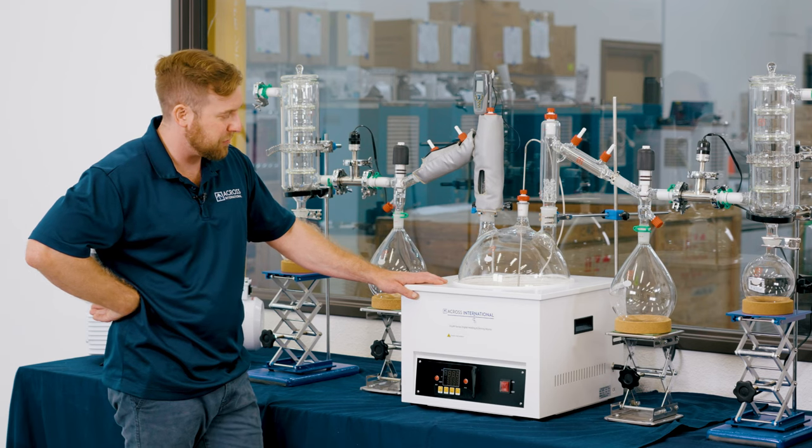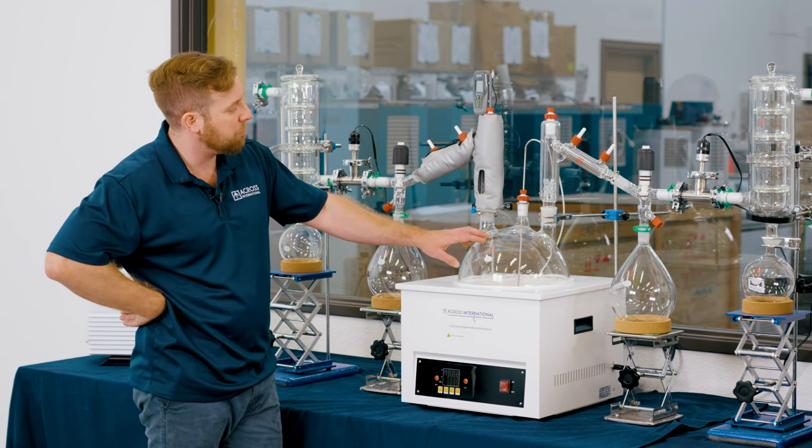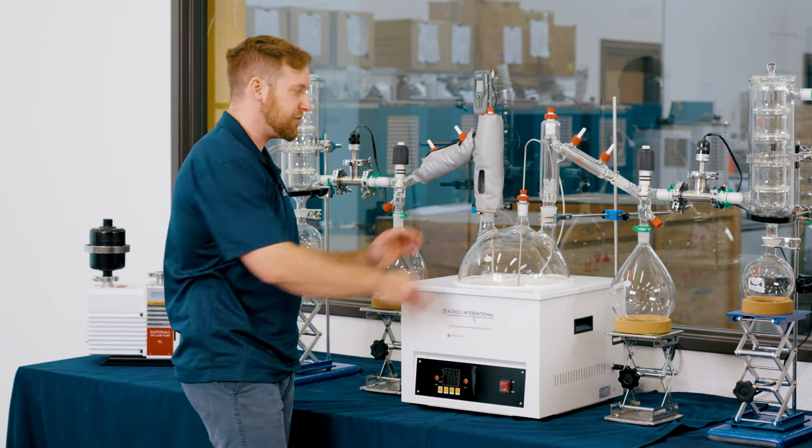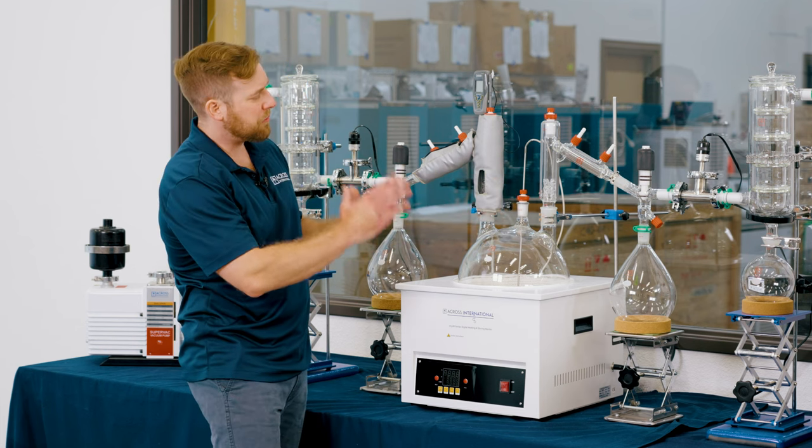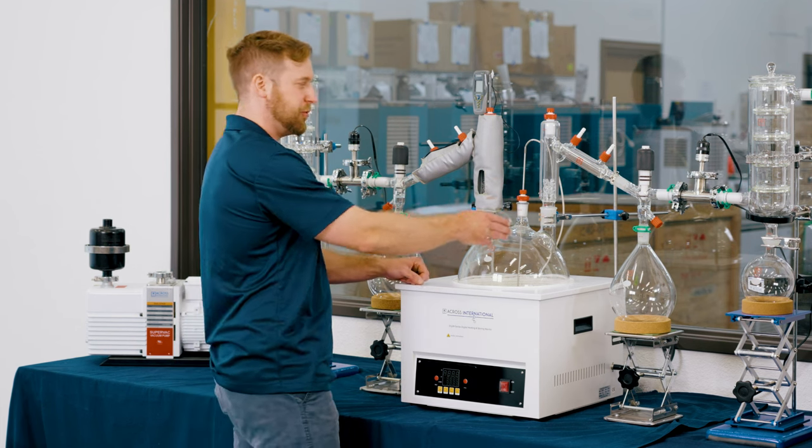From our ULCSA certified heating mantle, we move to the boiling flask. Here we have a 10-liter boiling flask with two necks. From our boiling flask, we're going to move up to our condensers.